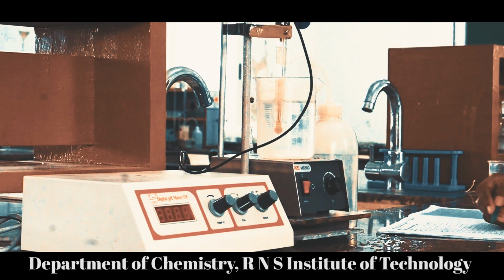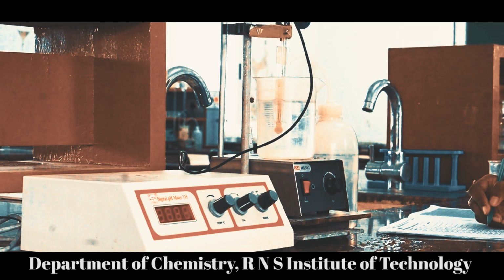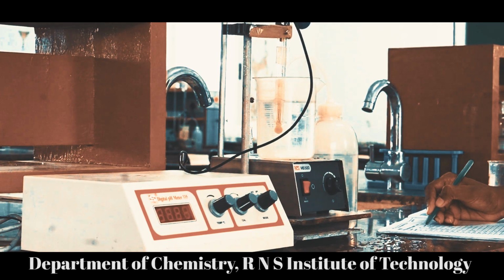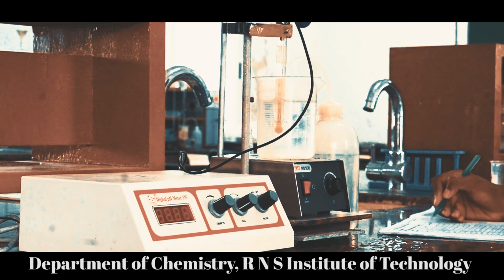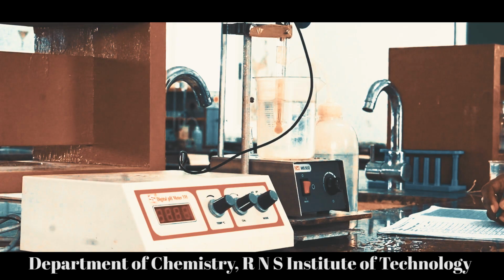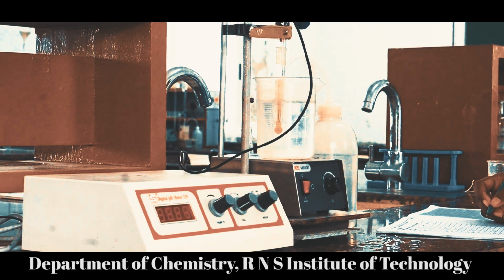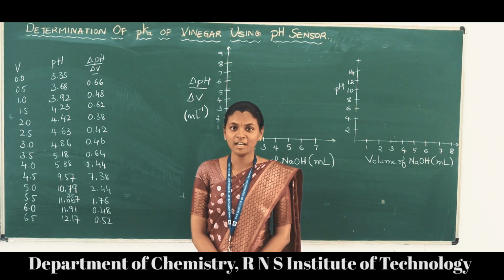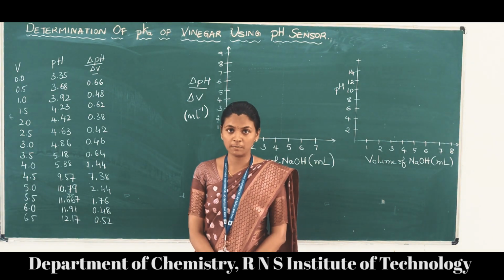Now let us use all these pH values which we have recorded during the experiment to calculate delta pH and delta pH by delta V. Using these readings, let us plot the graph in order to determine the equivalence point and half equivalence point, which is required for the estimation of the pKa value. Now let us see the observations and the calculations part.